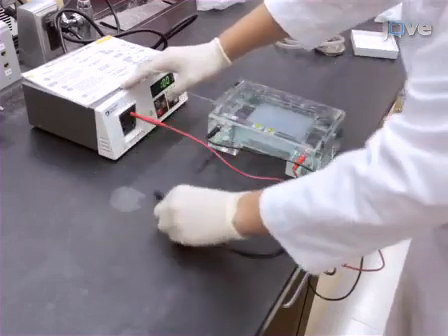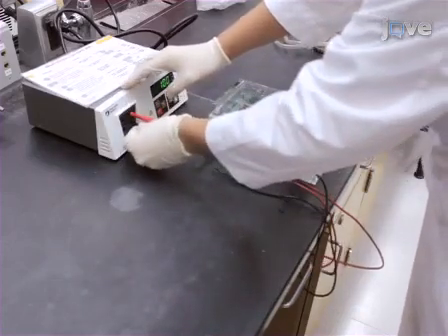Attach the leads of the gel box to the power supply and turn on the power supply. Verify both the gel box and the power supply are working. The appearance of bubbles at the electrodes indicates that current is passing through.